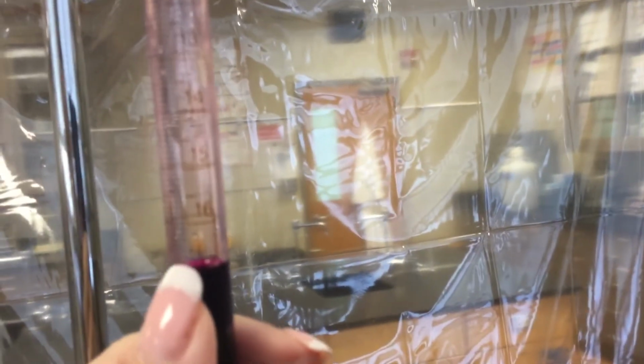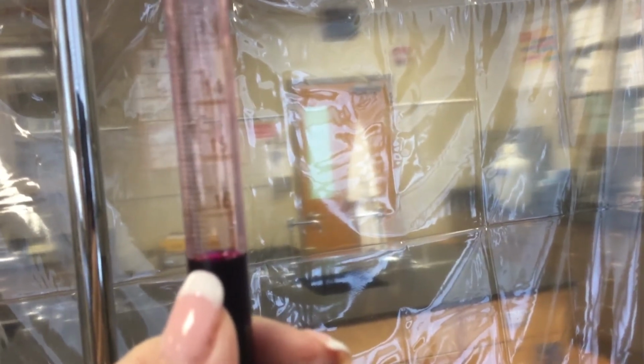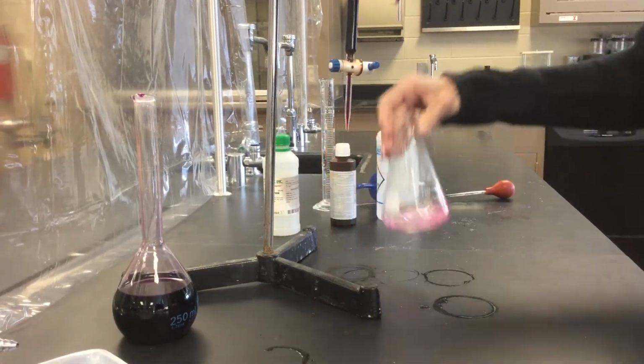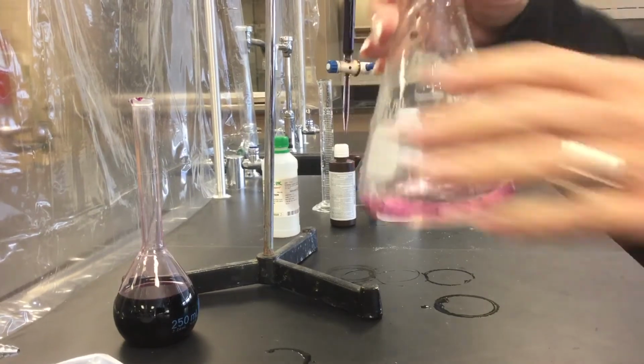Okay, so our volume then, I keep struggling to find the thing. So here is 16, 1, 5, 6, 7, 8. I'd say that was 16.9 for our volume. So that's our final volume for trial 1, as well as our initial volume for trial 2. Yep, that's a good faint pink. So let's rinse that one out and do our second trial.